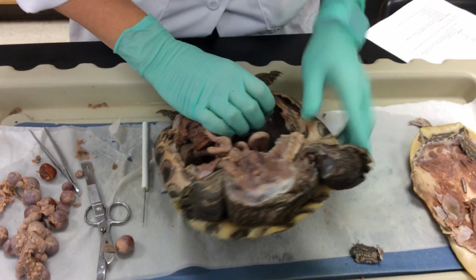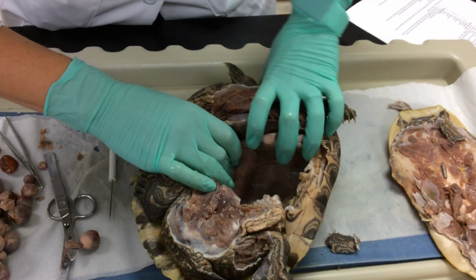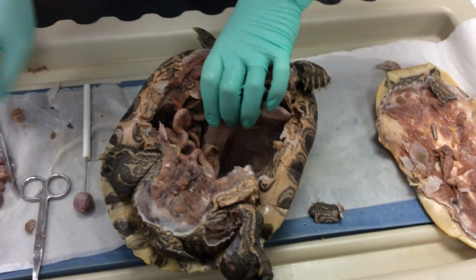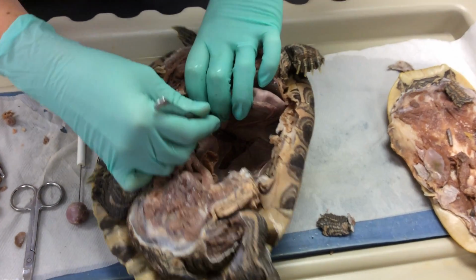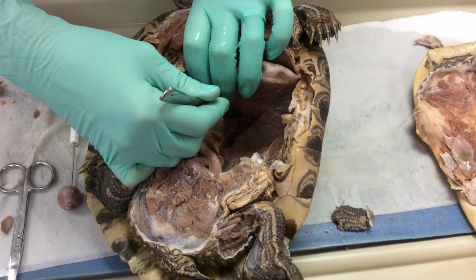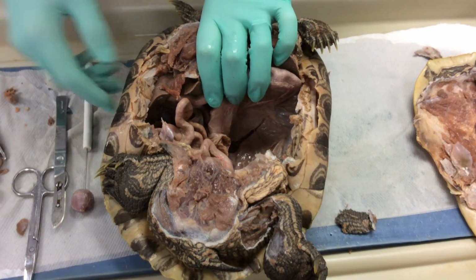If I pull this area up, I don't know if you can see deep inside, there is this squishy network of fibers right there. If I cut into it, it looks almost like a spider web. Can you see that in there? That spider web network is going to be the lungs. The lungs are located on both sides, so the bronchus is going to lead to that. So that's part of their respiratory system.